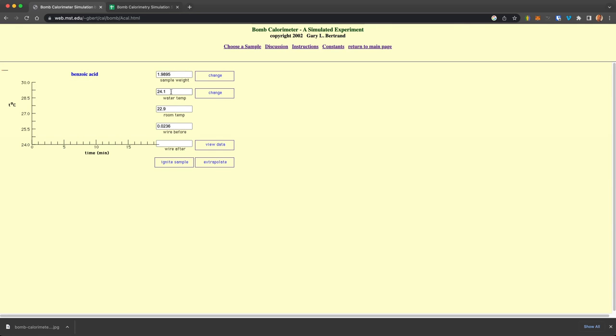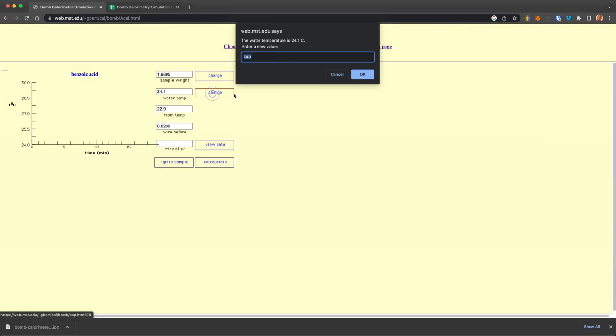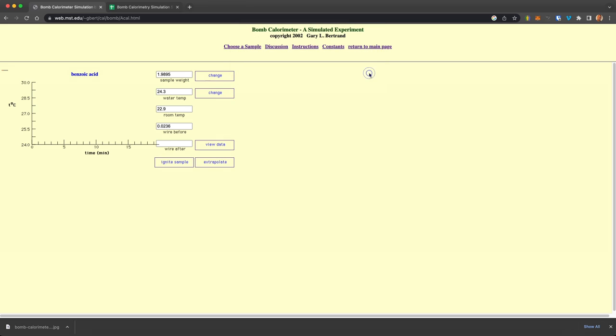You start with a certain temperature of your water, the water that you put into the vessel. So we could change this, say 24.3. You can't change what the temperature, the lab temperature is, or what the weight of the iron wire is. And this gives you your initial conditions.